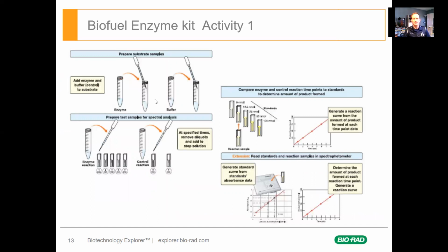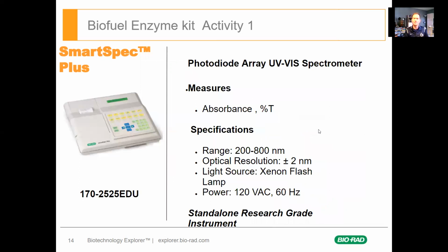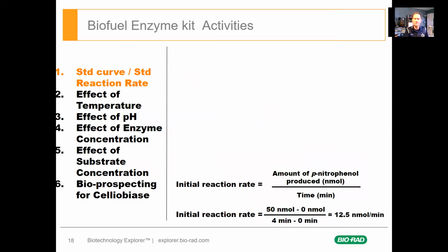Okay, let's take a look over here. You have your enzyme reaction occurring, and then at time 1, time 2, time 3, time 4, time 5, we leave 1, 2, 4, 6, and 8 minutes. You squirt a little bit of the reaction mix into the stop solution. Compare those with your standard curve and calculate how much is made. You're then able to determine the initial reaction, what the reaction was at the temperature in the lab on the day that we start.